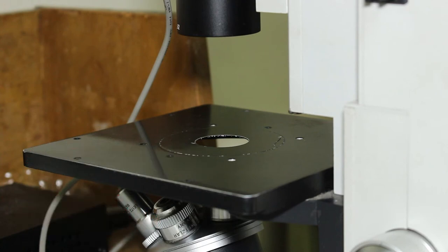This kind of microscope is often used for live cell imaging since cells have to be kept in growth containers during the imaging.